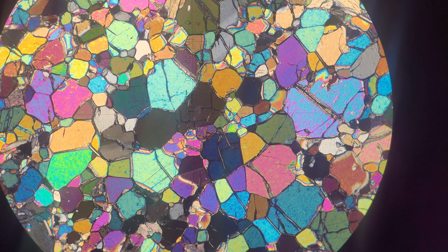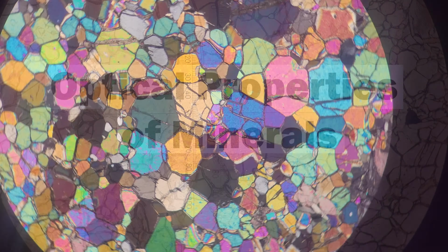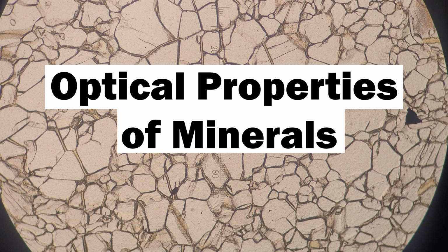This video is part 2 of the optical properties of minerals, and focuses on observations in cross-polarized light. If you haven't watched part 1 on the basics of optical mineralogy and observations in plane polarized light, click the card in the top corner, watch that, and then come back, as part 1 lays out the basics that we'll build on in this video.